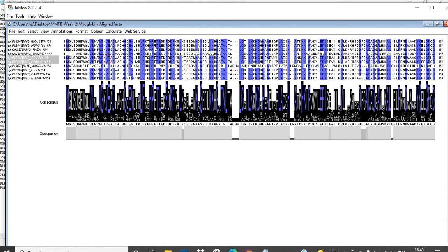So you see that the alignment has gaps also. These gaps are because the length is different. If you have two sequences and they are not equal in length, then definitely there will be gaps because the program tries to optimize the alignment.